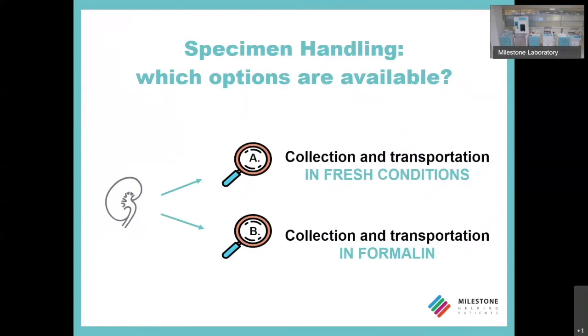With these two considerations in mind, for the specimen handling, which options are available today? Well, definitely we have the option to collect and transport the specimen in fresh condition, or collect and transport the specimen in formalin. So formalin, with all the considerations we have made, is still the state-of-the-art fixative.